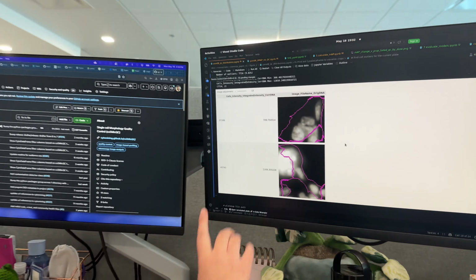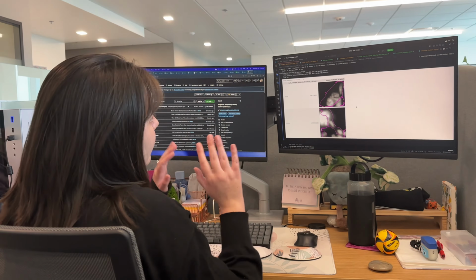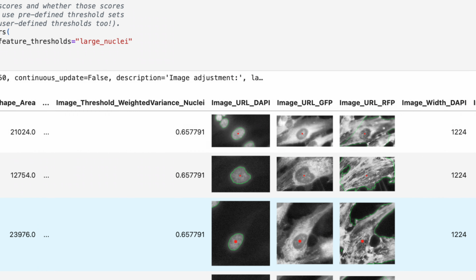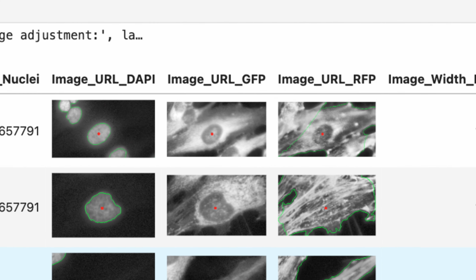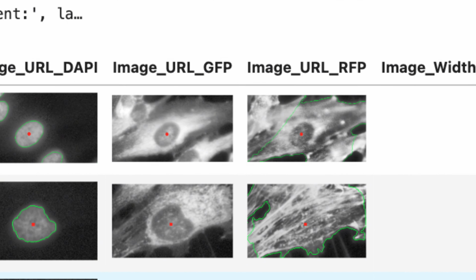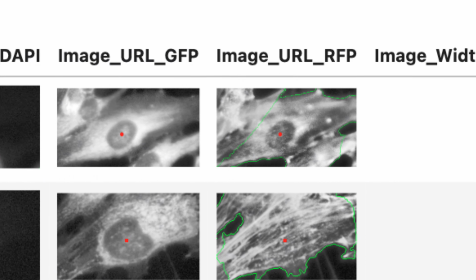Cosmic QC helps to label or flag incorrect segmentations, which you can then filter from your downstream analysis, which supports more accurate and cleaner results. So we know that if we have an object and the segmentation is going off of the object, that is incorrect. We want clean, smooth lines around that object instead of it going off and haywire.